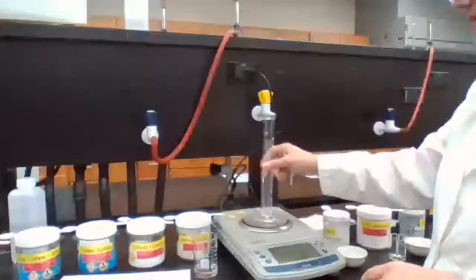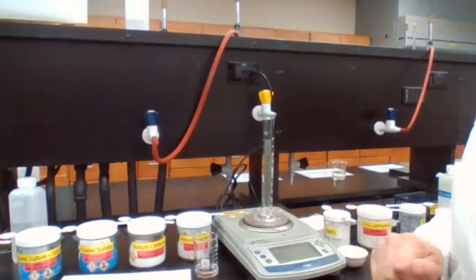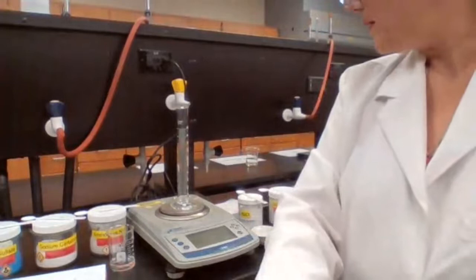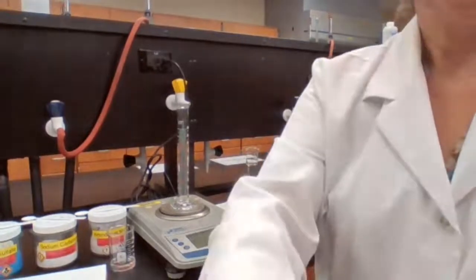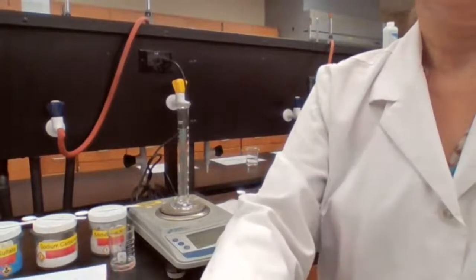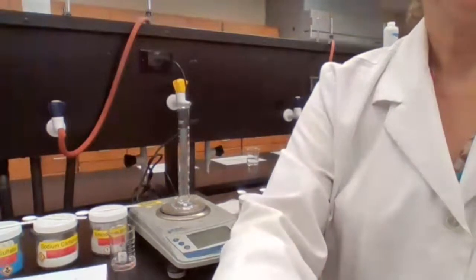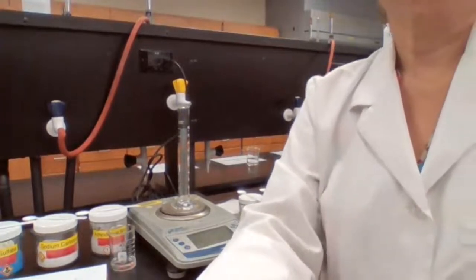0, okay. We place the graduate cylinder that actually can hold up to 50 milliliters of water. Record this number, and that number is 119.2. It's changing, so I'm going to write the most stable one, 119.285 gram. This is the mass of the empty graduate cylinder.